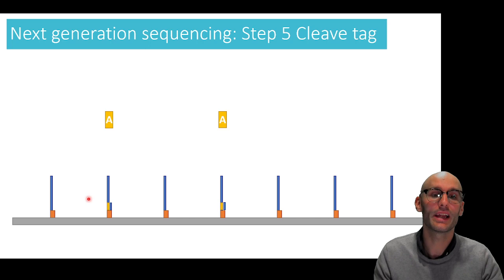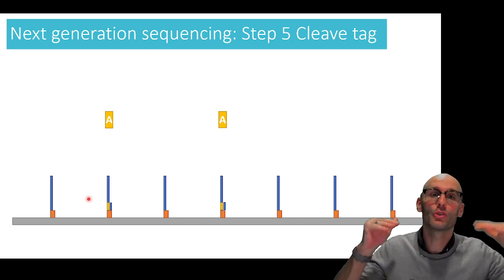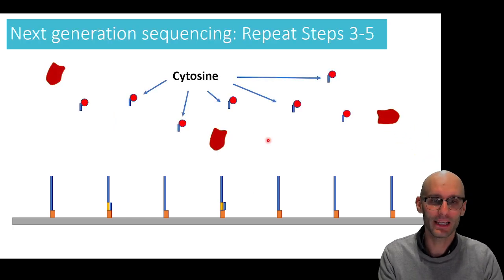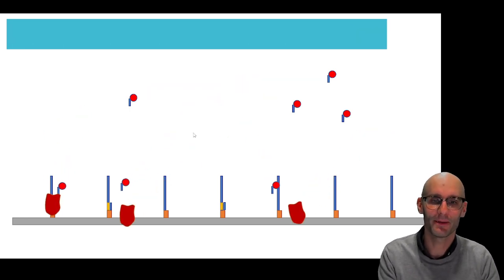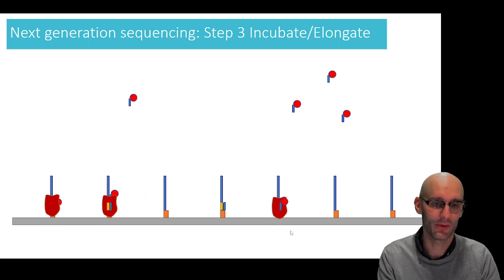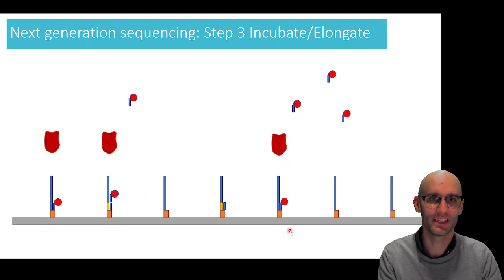And so now we're ready. We've got no more fluorescence on our glass slide. We're ready to attach more nucleotides to our fragments here. So here we go again. Now we're doing cytosine, the nucleotide. We're incubating it in our solution, and we've got our DNA polymerase there. And we get cytosine attaching here, here, and here with the help of our DNA polymerase. So the DNA polymerase enzyme is needed for each of these steps here.